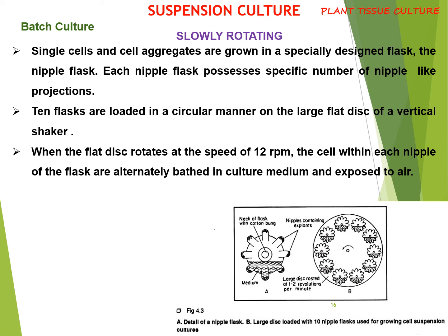When the disc rotates, the cells within each nipple of the flask are alternatively bathed in culture media and exposed to air.